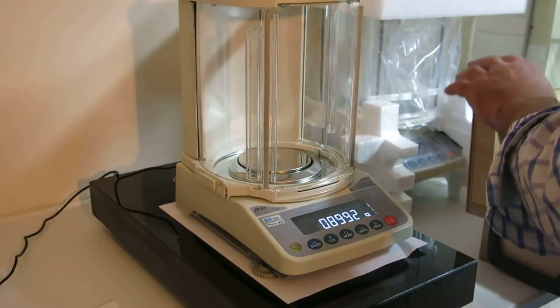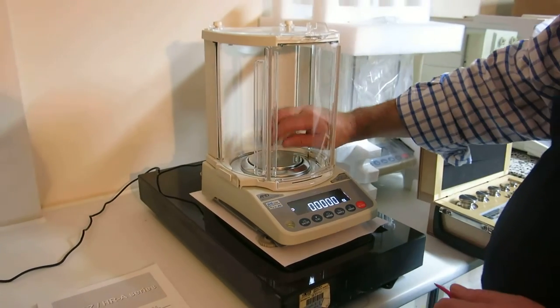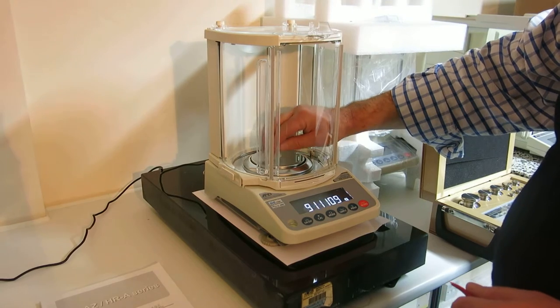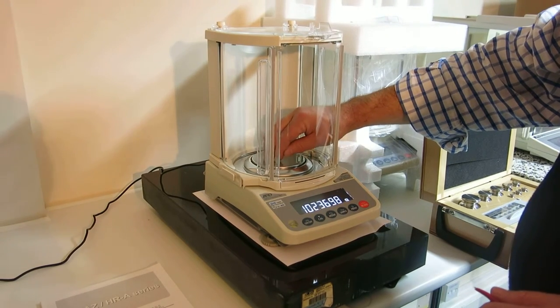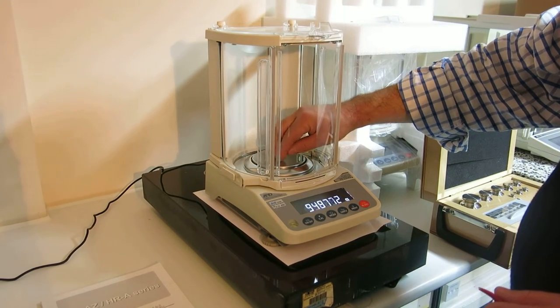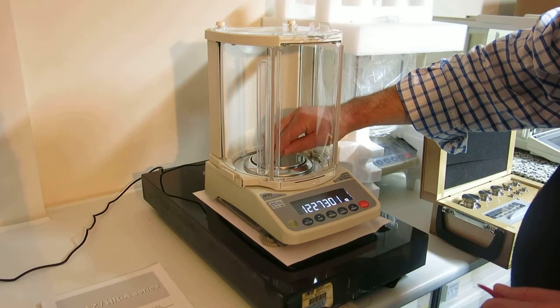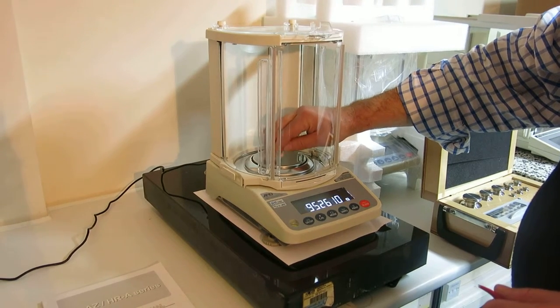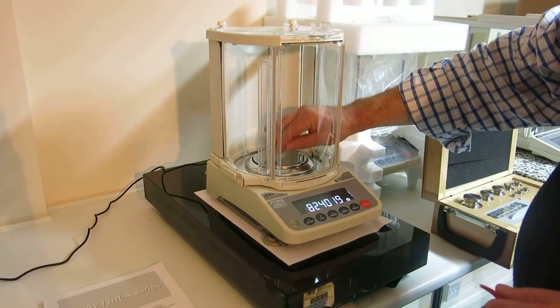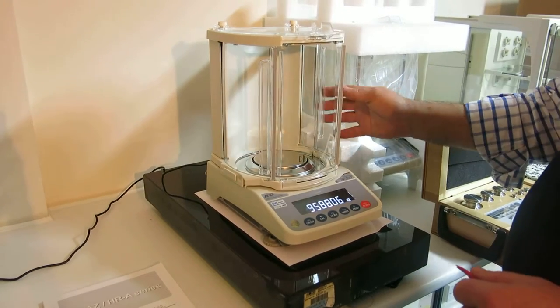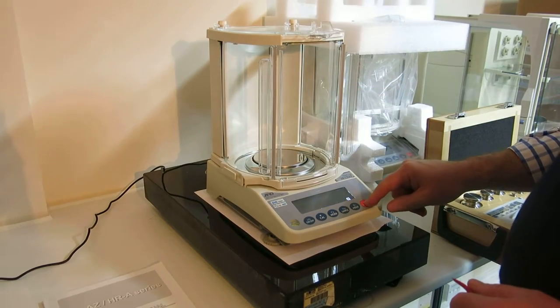The other beauty with this balance is the fact that it's extremely robust. The way it's designed is that it's made for heavy-duty applications. So you can see I'm giving it a fairly significant thump on there now. Close the draft shield over. We'll re-zero it.